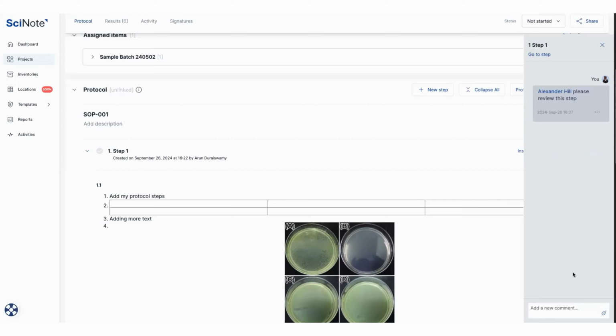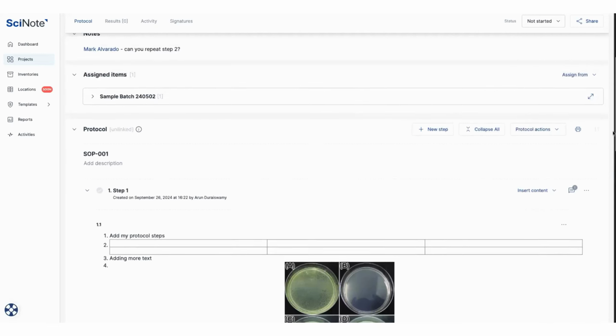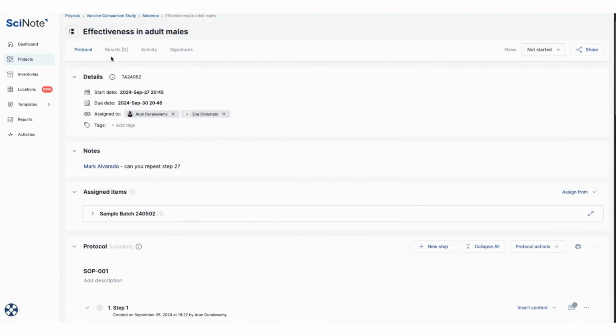He can open the same comment, respond to me, and this entire comment thread is preserved in case you ever need to revisit it to take a look at any changes that were made based on a conversation that happened in the comment area. All right, so now we'll hop on over to the results section.